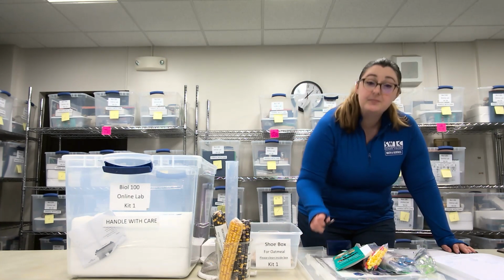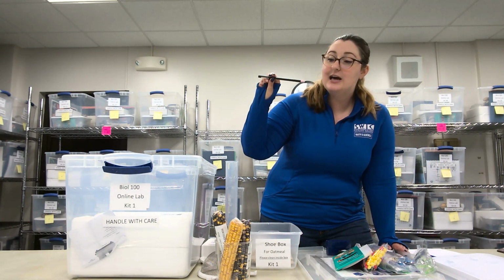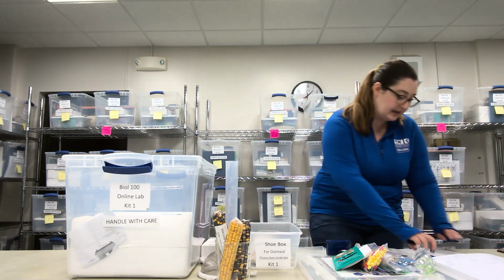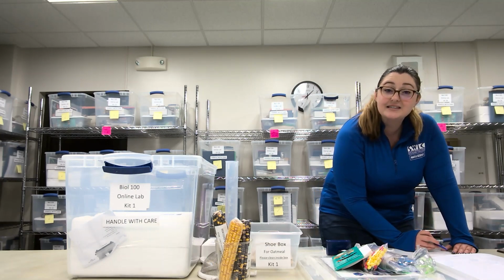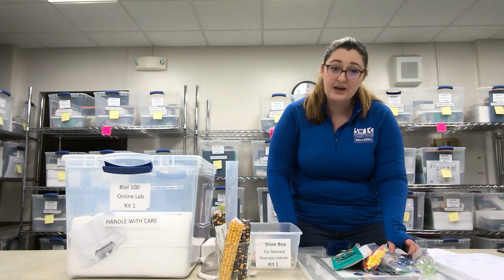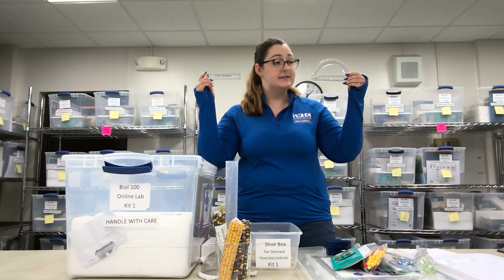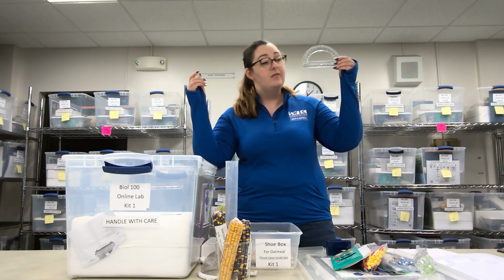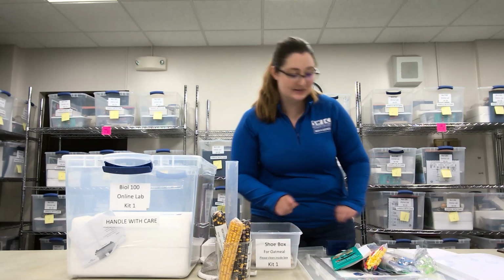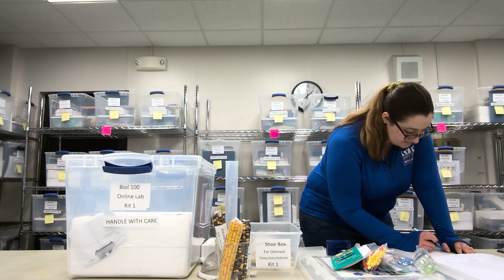The next item is going to be a wax pencil. The wax pencil looks like this. Should be a black kind of crayon looking pencil, and there it is. We're going to go ahead and put that in the box and check off that we have it. From there, I'm going to go through the next two items together. It is the ruler and the protractor. Just in case you aren't sure what the difference is, this is a ruler and this is a protractor. Go ahead, put them into the box. Check off ruler, check off protractor.